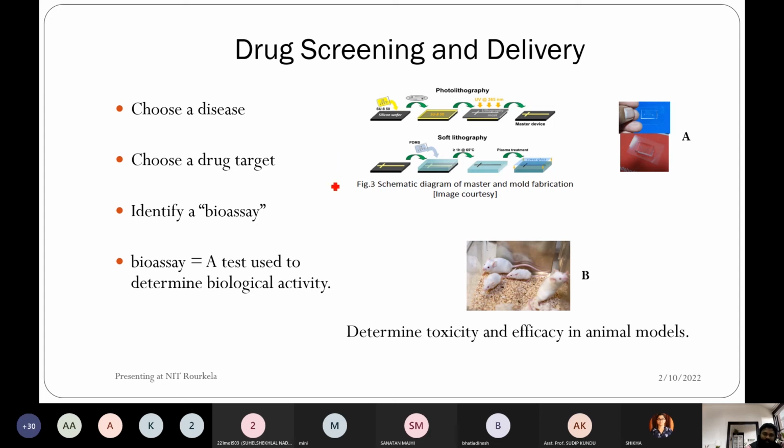For example, you have blood cells suspended on a microfluidic device, and you enter the drugs into that, right? You have entered the drug, and you have samples here. So the drug is passing through, and you have the laser source and detector arms. Then what morphology is taking place when you add the drug, and whether the cells are still surviving or multiplying inside or not. This kind of application you can use.